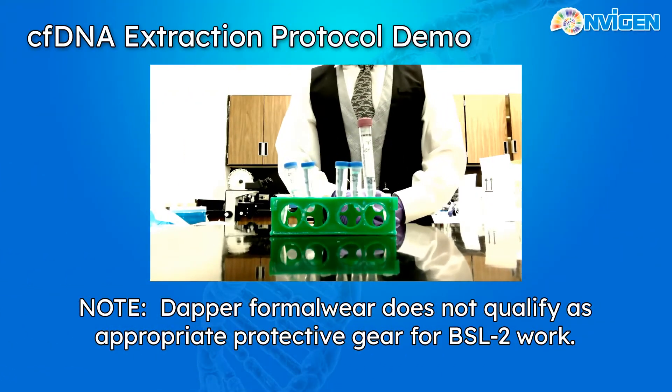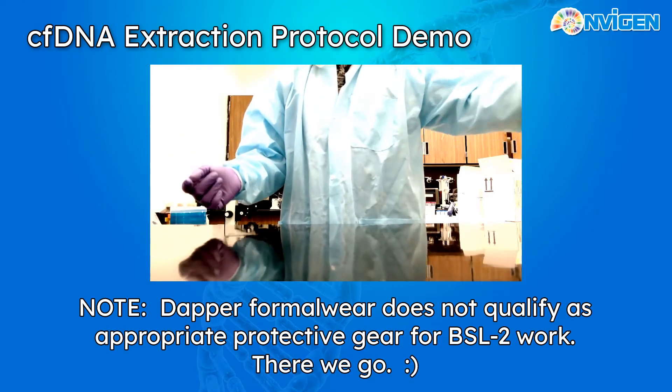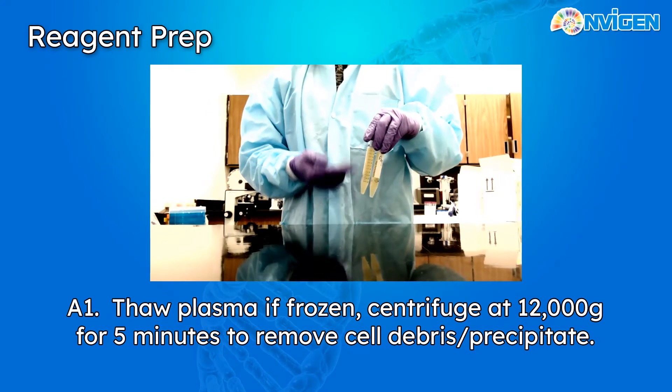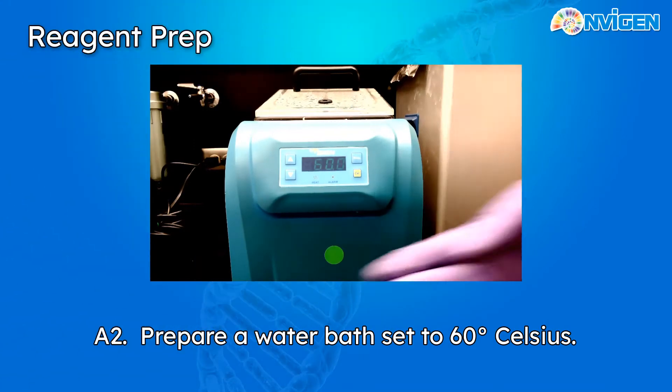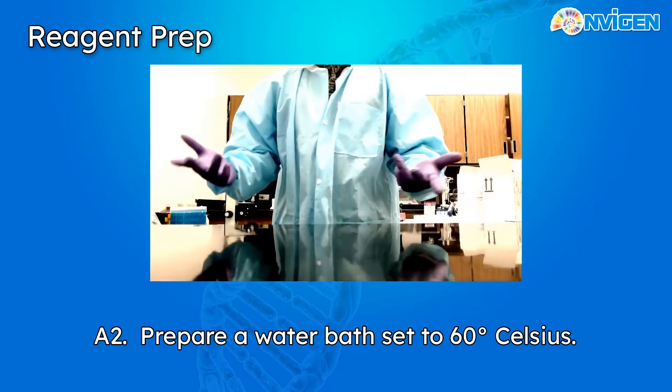Now since we'll be working with plasma, I should get changed. First thing we'll need to do is clarify our plasma samples — centrifuge down at 12,000 g for 5 minutes to remove any cellular debris or precipitate. You'll also want to have a water bath set to 60 degrees Celsius. Now let's prepare our reagents.